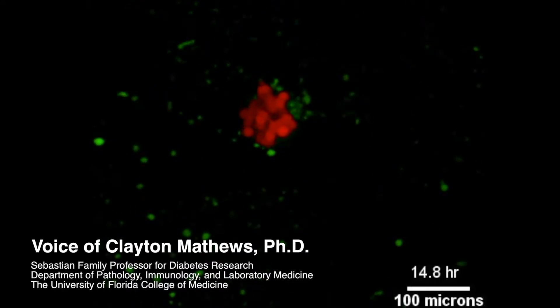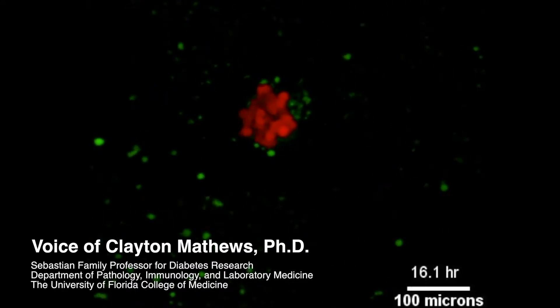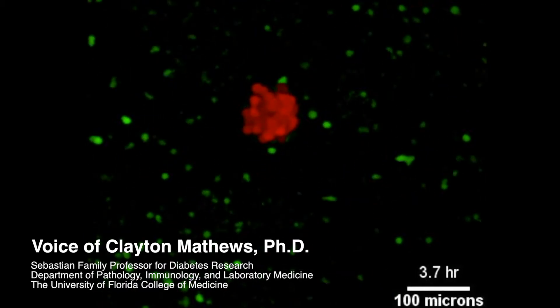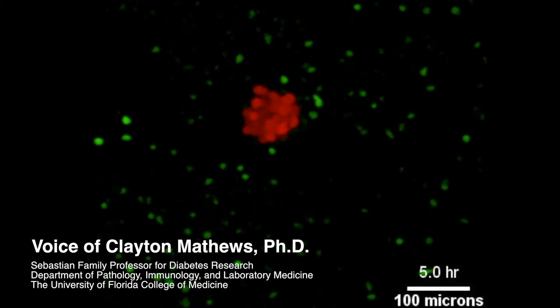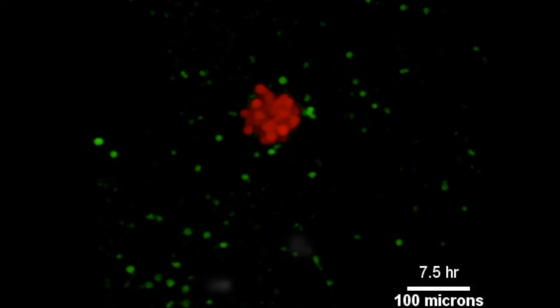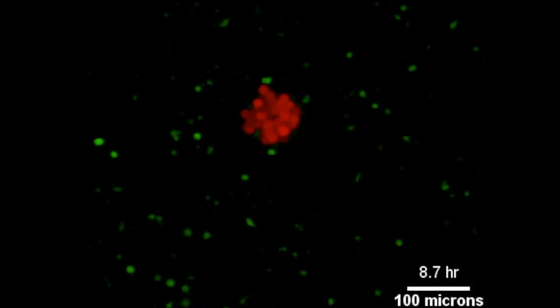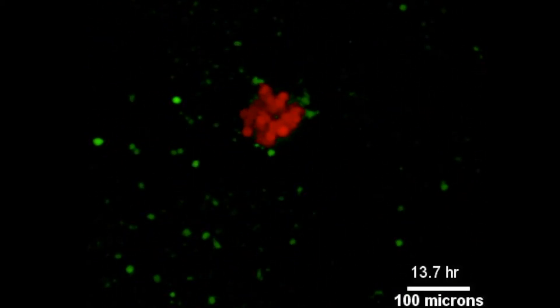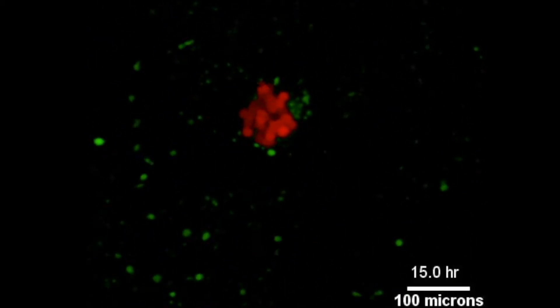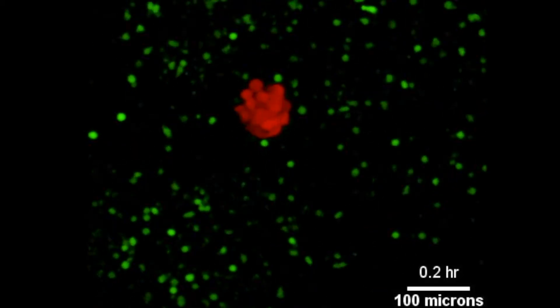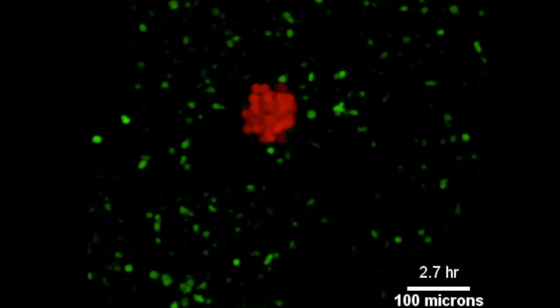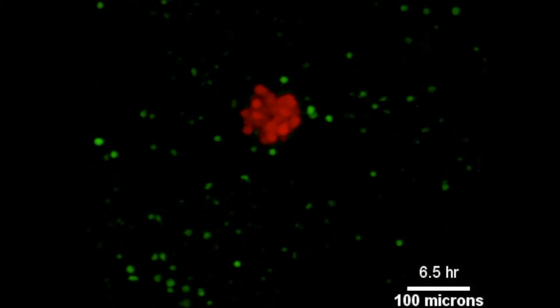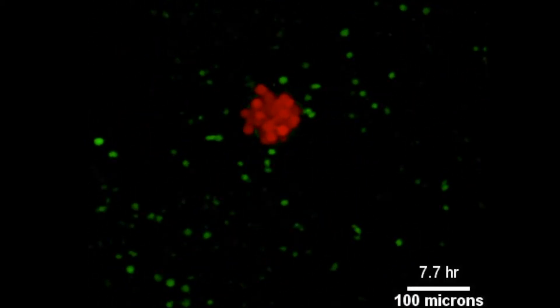Initially what you're seeing is that the T cells are in significant movement. What will be apparent from the beginning to the end of the video is that these beta cells, or red cells, that are in contact with the green T cells are slowly going away. So the T cells are killing those cells.